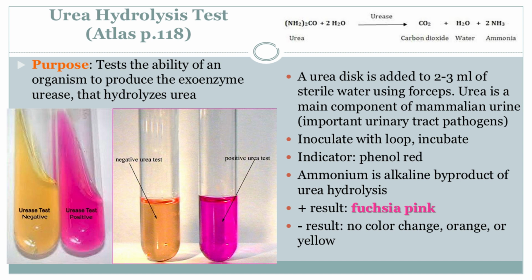Got it. And some bacteria actually prefer things a bit more on the alkaline side. Exactly. They thrive in those conditions. So they're creating their own little comfy environment. Like tiny little pH adjusters. But how do we actually observe this in the lab? Well, that's where things get really visual. Oh, I like where this is going. Tell me more. Imagine a broth, a special bacterial soup, if you will, that starts out yellowish-orange.